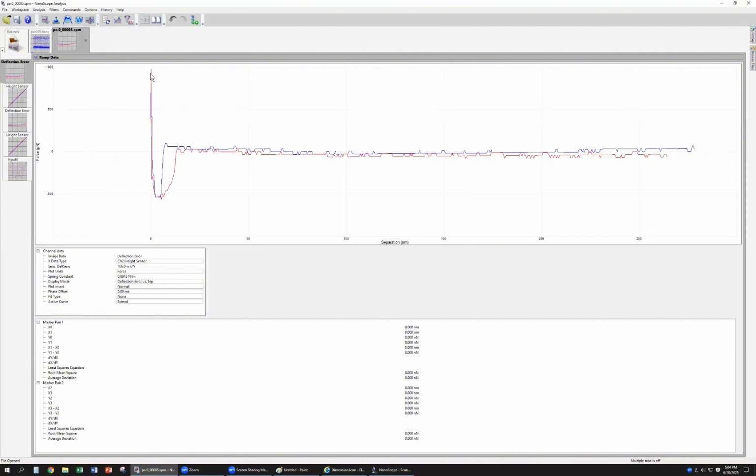That means this is the point. If the direction is only a line, a straight line, that means no indentation depth. That means your probe cannot push inside your sample, so your sample has no change.